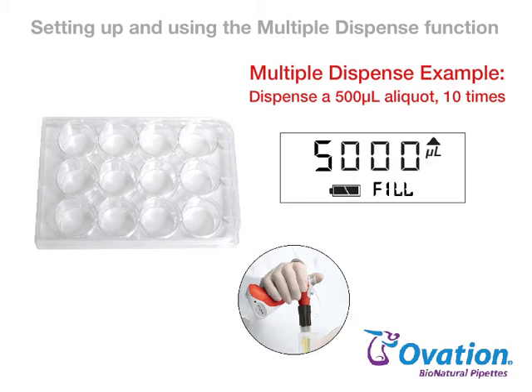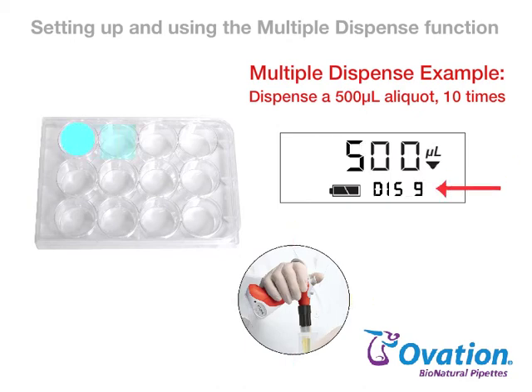Press and release the pipetting trigger to dispense each aliquot. The display will indicate the volume being dispensed and the number of dispenses remaining.